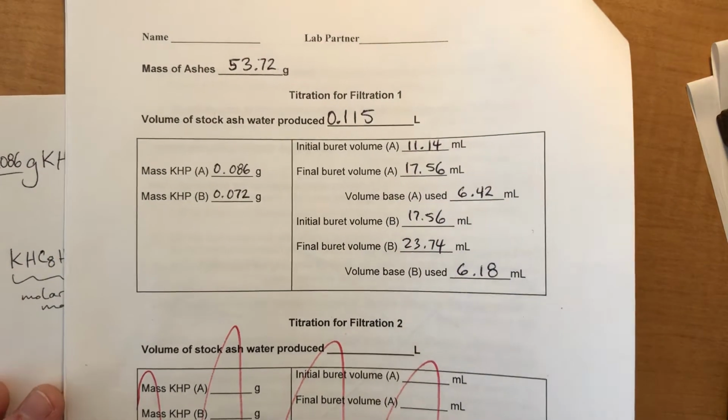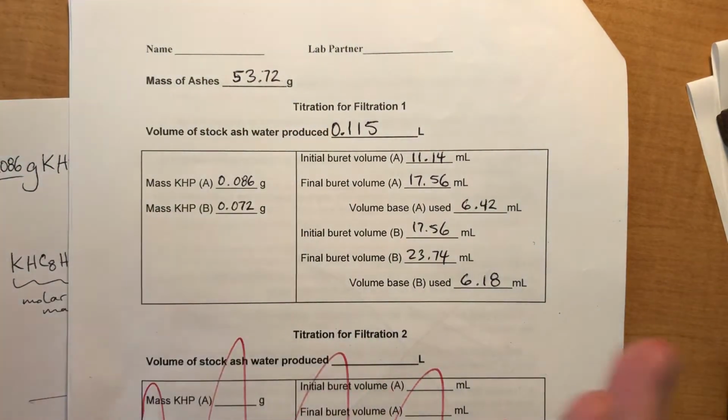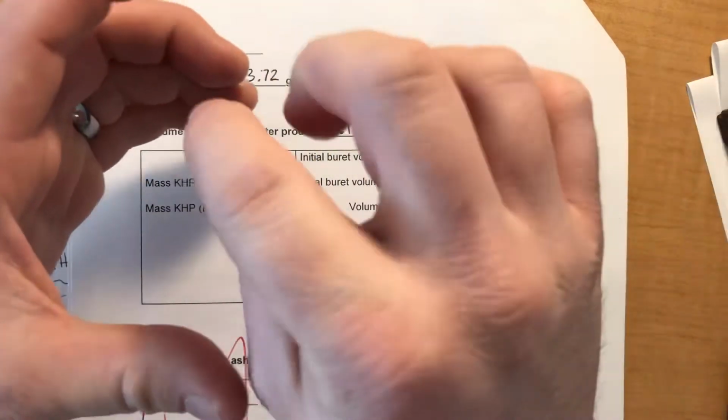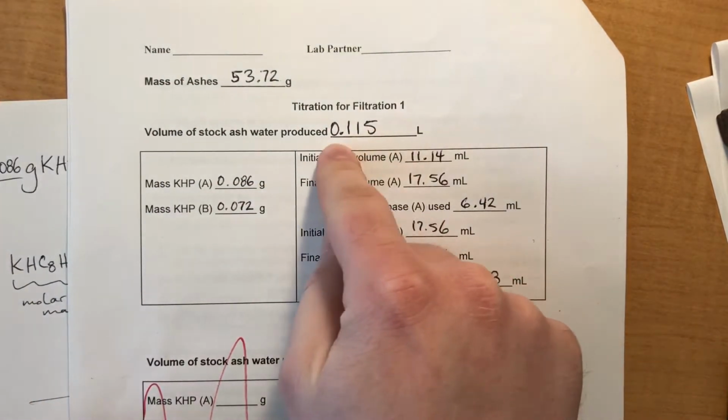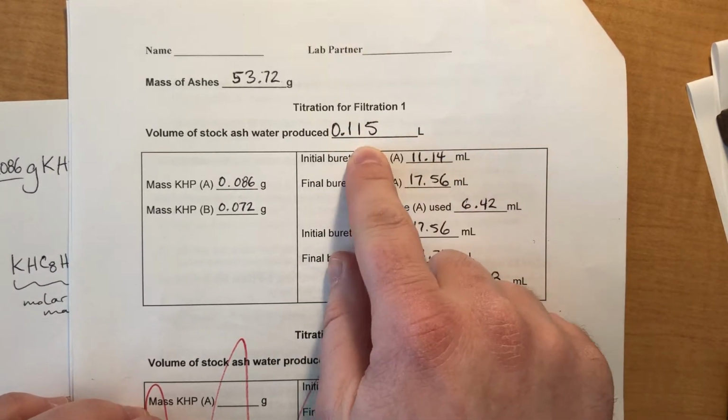Okay, so here's the general idea. I measured out my ashes. I have no idea what your numbers were. I just made up a number here. Total volume of the solution when you poured it back into the tall graduated cylinder, let's say it was 115 milliliters. I divided it by 1,000 to get 0.115 liters.